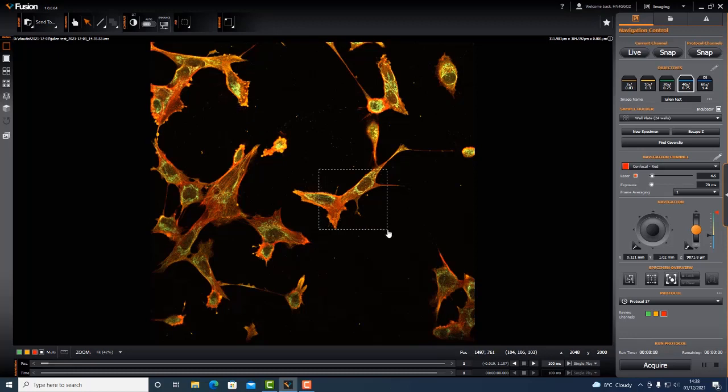I have my point tool. You use this for a number of reasons. You can use this, for example, to define a region that your camera is going to capture over if you wanted to crop your image for faster frame rates. And then I have a number of tools here, for example a point tool. If I wanted to register a position in an image and move my sample and register a different position, I can start to track different positions, different cells according to my needs.